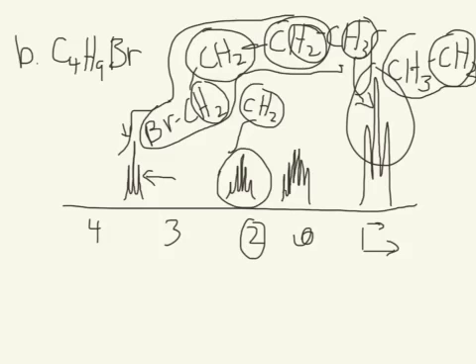Okay, this CH2. We can assign it to this signal, because this is, I guess, the only unassigned signal left. And this is pretty much where you'd expect a normal CH2 to be. And the splitting should be with a total of 3 plus 2 hydrogen neighbors, for a total of 5 hydrogens, so there should be one more peak. There should be 6 peaks, and voila, there are 6 peaks in that signal. So that makes sense.